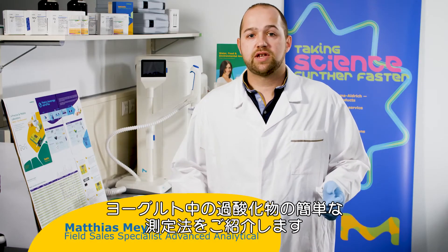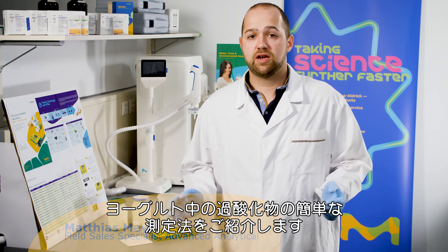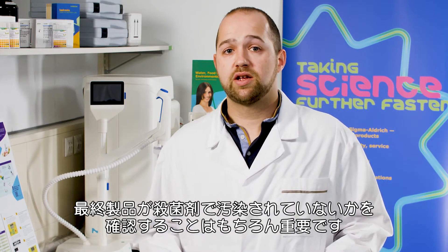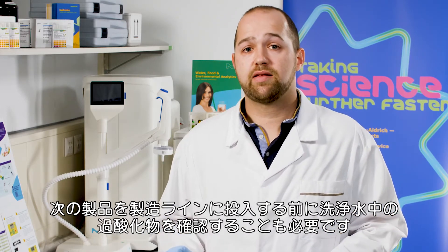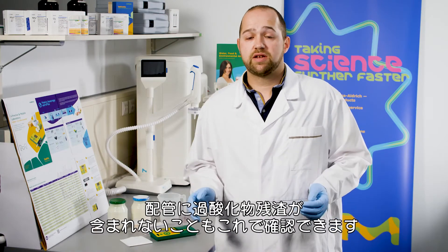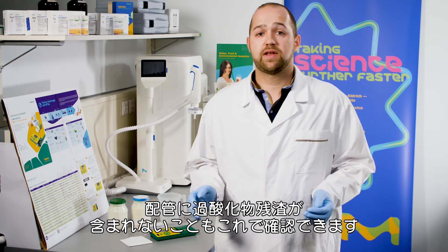Hi guys, I'm Matthias. Today I want to show you how easy it is to check the peroxide content in yogurt. It's very important that you check whether the final product is contaminated by the disinfectant or not. Also, before you pump the next product through the lines, the peroxide content has to be checked in the wash water to ensure that the pipes are free of peroxide residue.